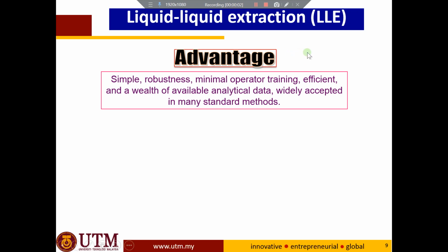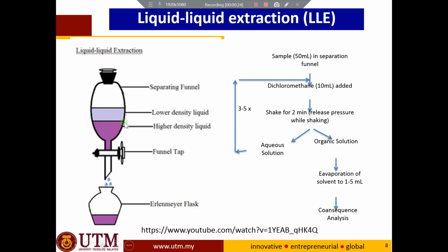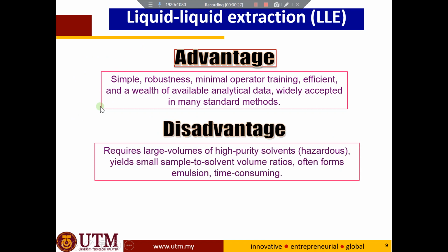Okay, the advantages of liquid extraction are that it is simple, robust, needs minimal operator training, is efficient, and has a wealth of available analytical data, widely accepted in many standard methods. So far, almost all standard methods for liquid extraction use the conventional technique, using the separating funnel. Very simple, not difficult at all, robust, no big problems, minimal operator training, it's not really complicated, so no need for difficult training, very efficient.